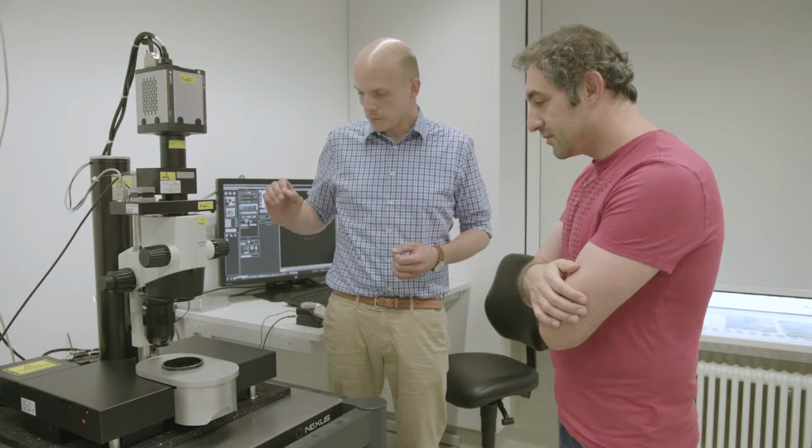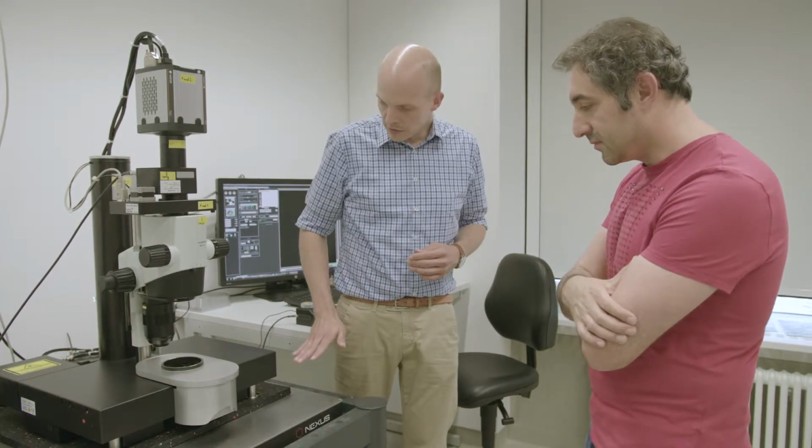Yes, for sure, I'd like to. So about the microscope, it is a light sheet microscope which is designed for imaging clear and large samples. Let's say, for instance, you have a sample the size of a mouse brain or a mouse embryo. This suits this kind of system perfectly. The system illuminates the sample from the left and the right side. You have a very homogeneous illumination of the sample. And then we just move the sample through the light sheet, and the detection path is acquiring images on top.